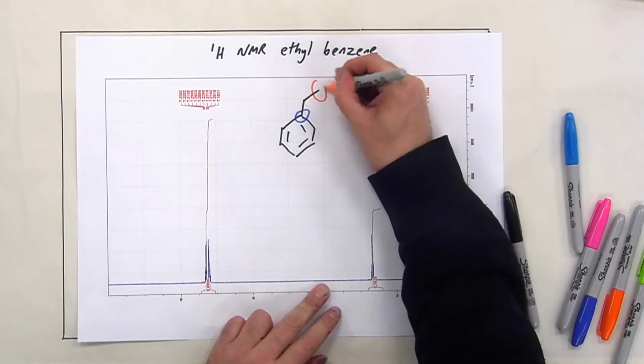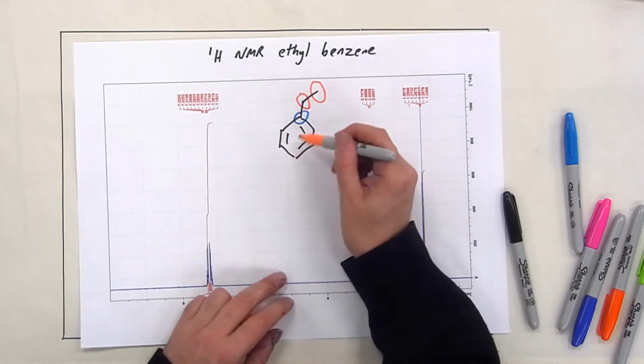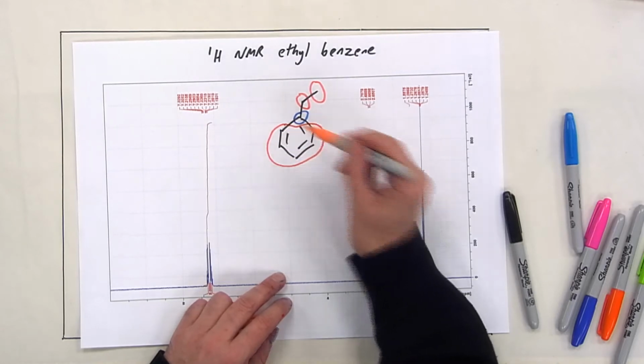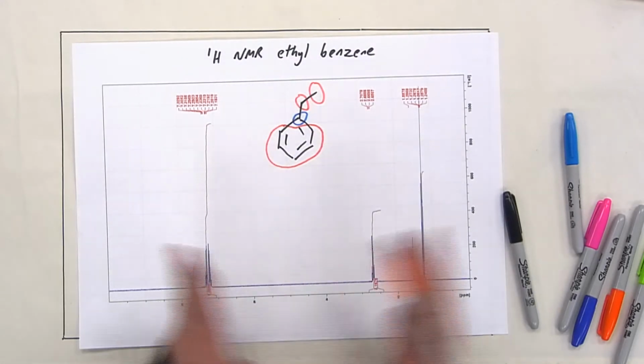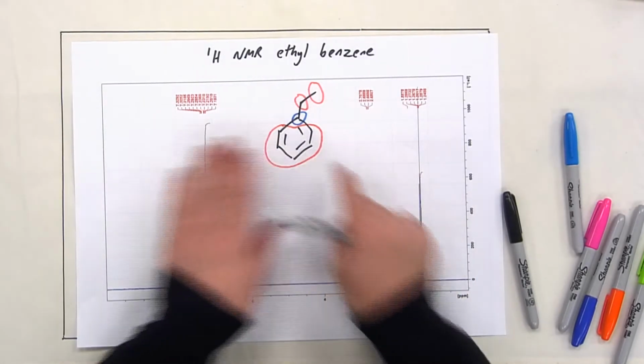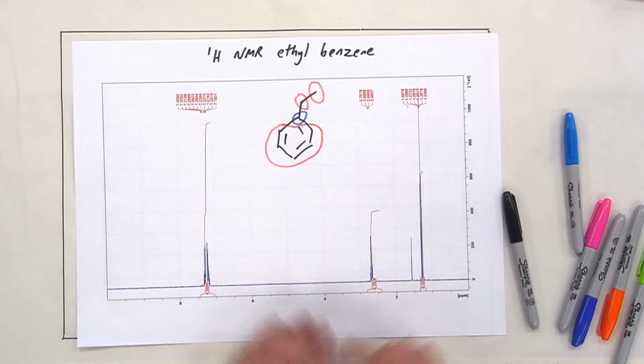So you'd expect to see, let me change colour because otherwise it's been very confusing, one here, another one here, okay, and then actually because these are all very similar, we'd expect to see kind of one signal, because the separation is much less in proton NMR, one signal due to all of those hydrogens. Well, certainly, as it's similar to the case that we had with the carbon, it's quite hard to assign those. So what we would like you to do in the next widget, so I shall get that up now.